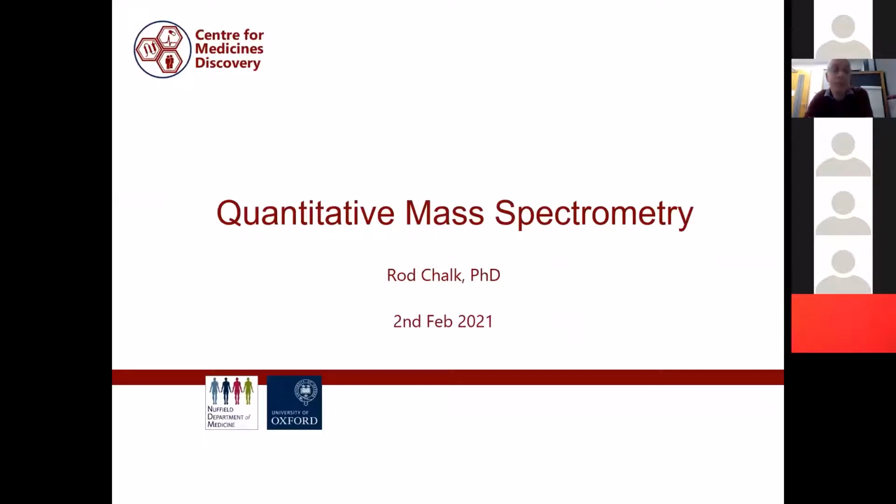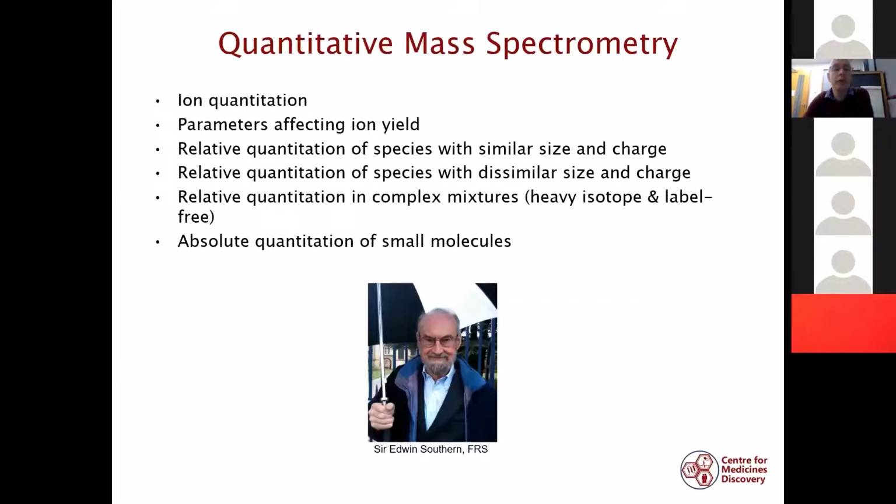Welcome everybody. Today we'll be looking at quantitative mass spec. And what we'll do is we will look at ion quantitation. We'll look at parameters affecting ion yield. We'll look at relative quantitation.